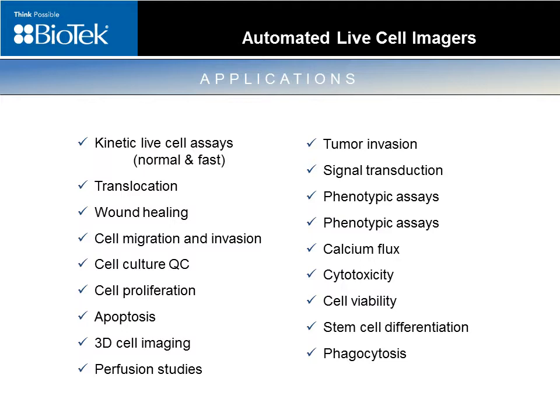So given these unique capabilities, these automated live cell imagers can be used for a wide range of applications, with just a few listed here. However, for the remainder of this presentation, we'll focus in on just one application in particular, which is cell proliferation.